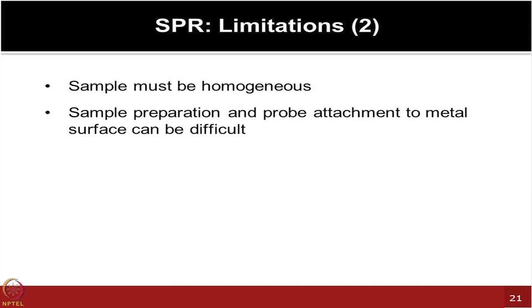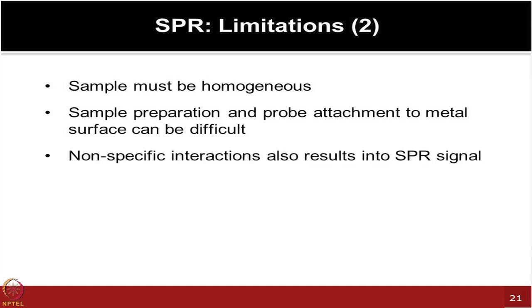Sample preparation and probe attachments could be difficult, but these are generic things that apply to any kind of chip-based assay which you have to follow. You have to ensure that your washing and all your cleanup steps are well performed, otherwise you will have many non-specific interactions.